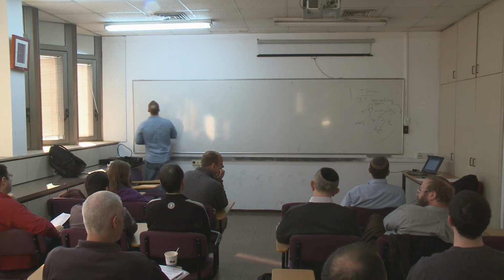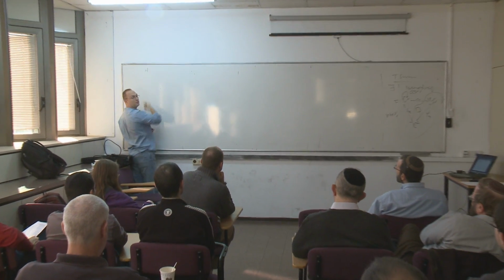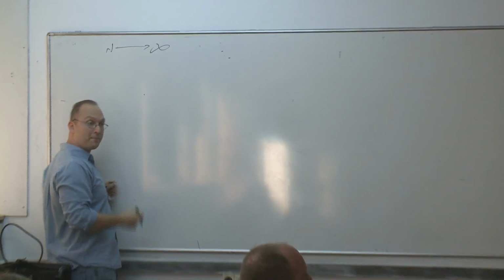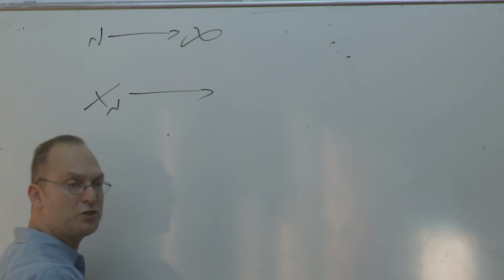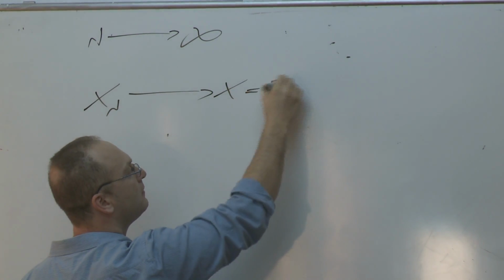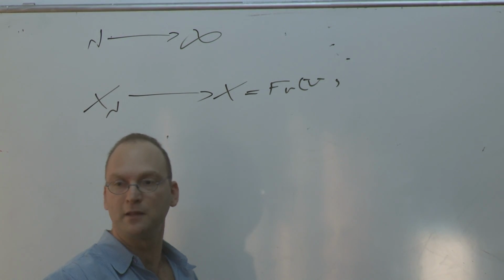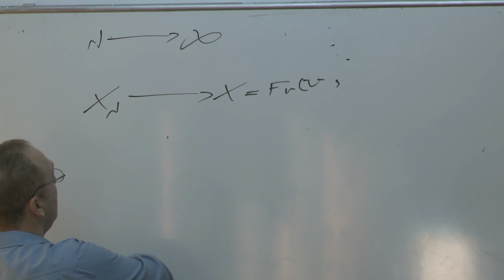So the explanation is based on considering the continuous limit of the algorithm when the number of images goes to infinity. So what happens in the limit? The configuration space X_n converges, measure theoretically if you wish, to the frame manifold. And here I'm assuming that the molecules are distributed independently and uniformly at random. So this thing converges to this.